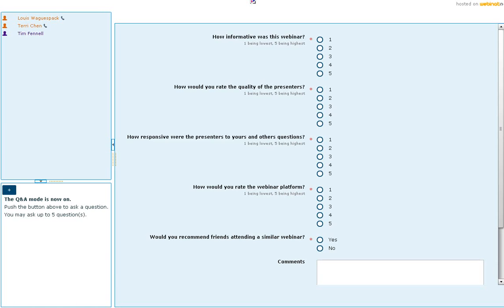The question you ask, I understand. If you load your sample between parallel plates, there will be a diffusion limitation from the edge of the parallel plate to the center. In most cases you will see the edge gets cured, but the center still remains uncured because moisture cannot diffuse in. So the specific geometry I used is an annular ring geometry, which allows the humid air to diffuse from both sides of the sample. We did some presentations and have some good posters regarding using this kind of special accessories. If you are interested, I'll be happy to share some more documents with you.